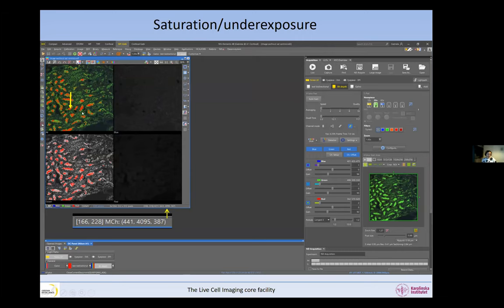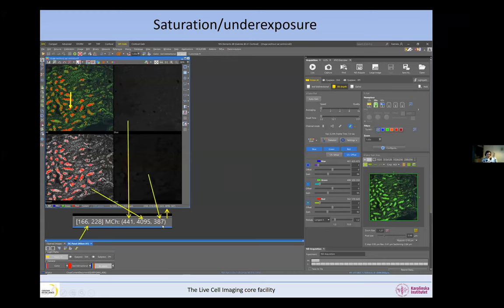In general, when you have an image in whichever software you have, if you hover your mouse over the image, you will get some information somewhere. In the Nikon software, it is at the bottom of the image. If I put my mouse somewhere in these pixels, I can get the XY position and the intensities in the three channels. You can do this with any software.